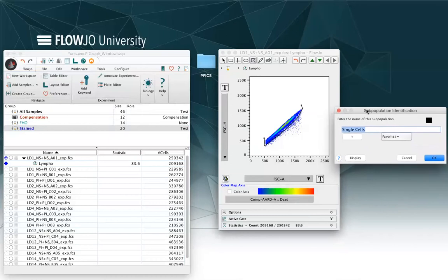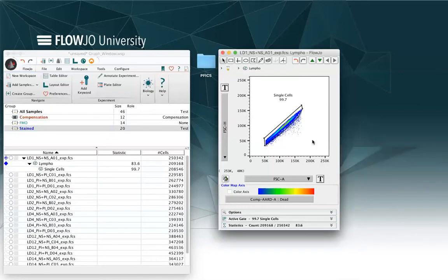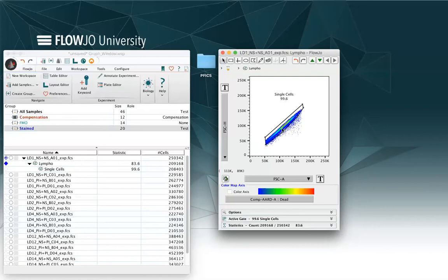In this case that I have forward high versus forward area, FlowJo will suggest me that these are single cells. I'm OK with that. And I will just click on OK. And even in this case, I can adjust my gate and make it tighter or move it around.